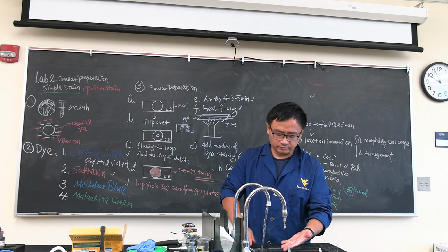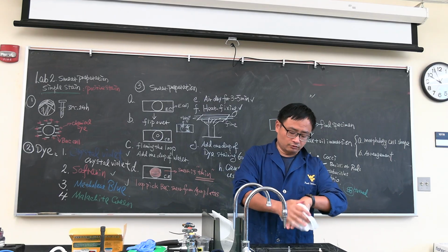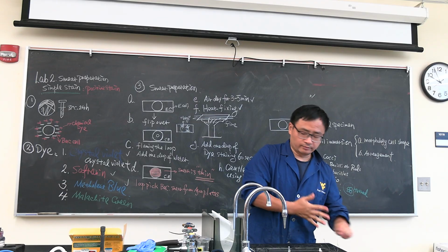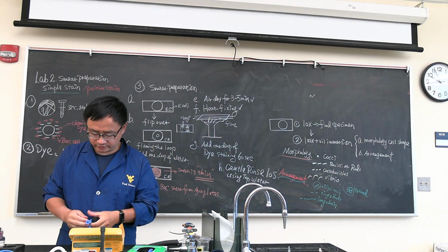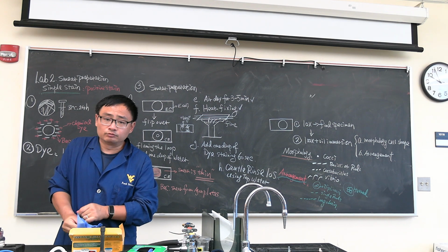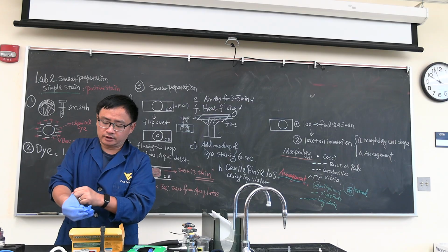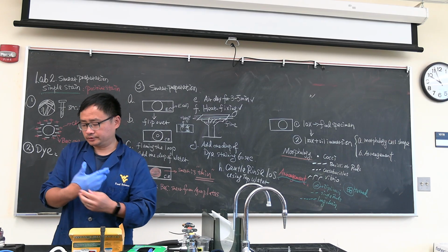It is the first time we'll touch the bacteria. So like I said, you're going to wash your hands first. And after that, you wear the gloves. I'll move to the bench right here. Then everybody come, and I can show you how to do it.